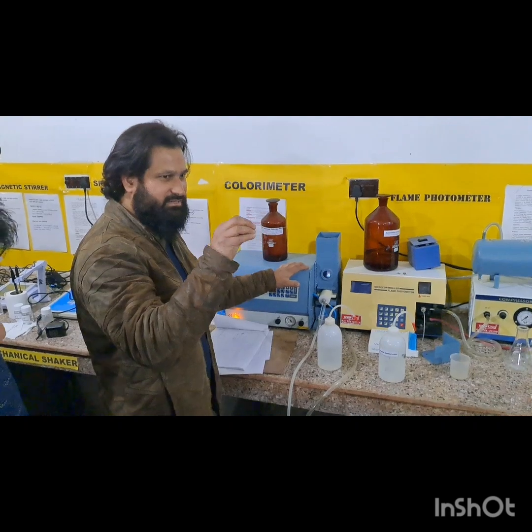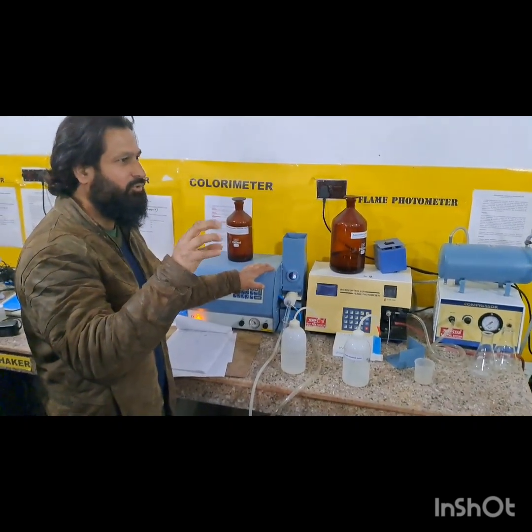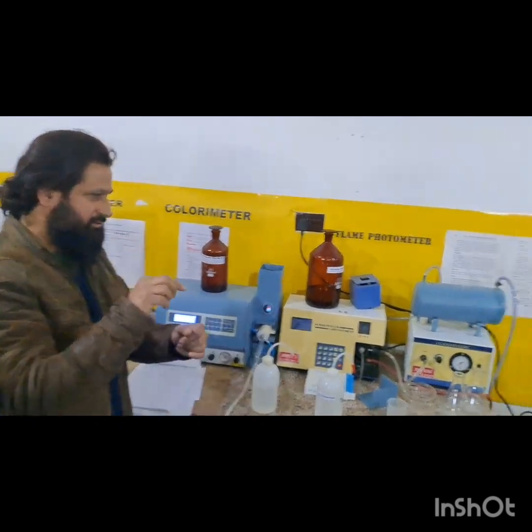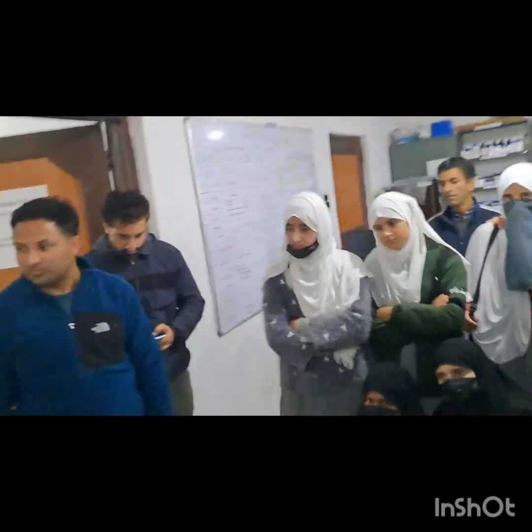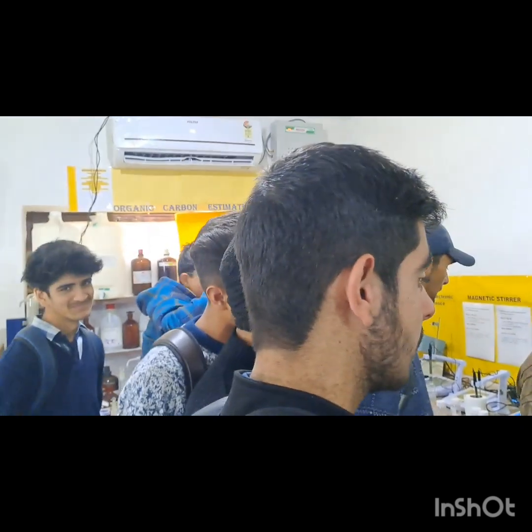5. Interactive session and Q&A. The session concluded with an interactive Q&A, where students asked questions about soil health, crop rotation, and environmental factors affecting soil quality. Dr. Inam and the lab technicians addressed each query, making it an engaging and informative experience.